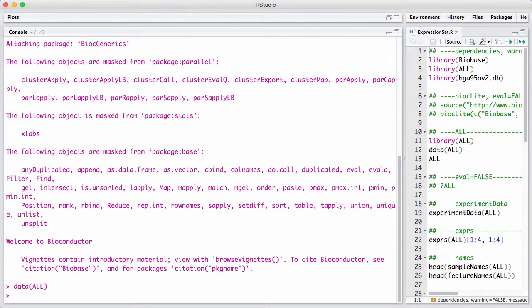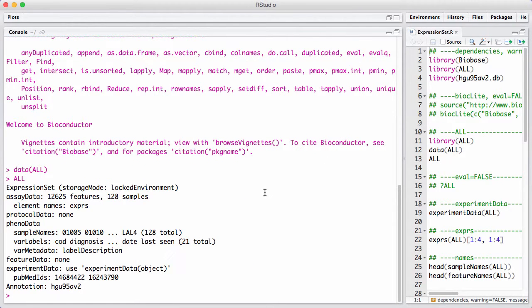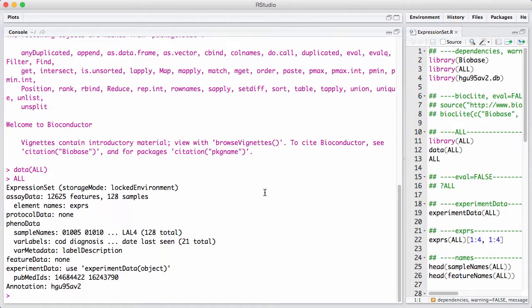So there's a data set called ALL, and we can try to print it. And from the print method, we see that this is an expression set. There seems to be around 12,000 features. In this case, features are genes and there are 128 samples.